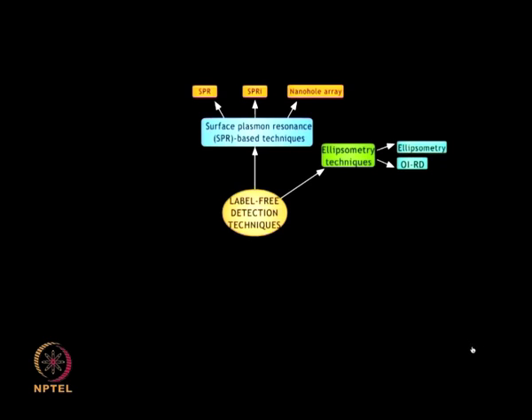Ellipsometry based techniques. First, ellipsometry. The change in polarization state of reflected light arising due to changes in dielectric property or refractive index of surface material is measured. Second, OIRD or oblique incidence reflectivity difference. The variation of ellipsometry that monitors harmonics of modulated photocurrents under nulling conditions.